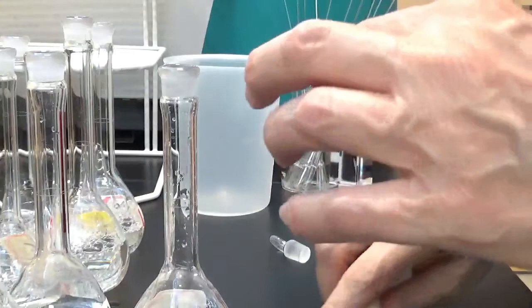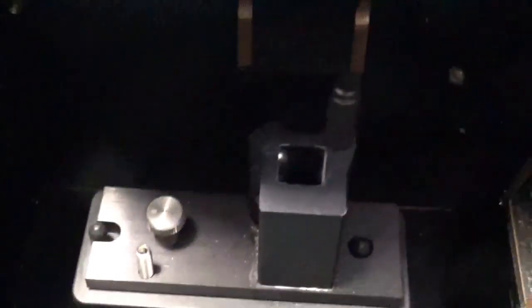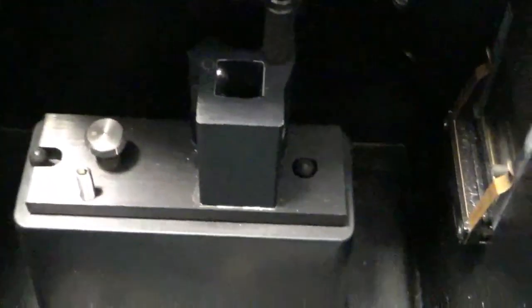Okay, so I've got my first solution, and what I'm going to do is I'm just going to put it in this fluorescence instrument, this fluorimeter. So I have to open the top, and there is room for 1 cell in there.